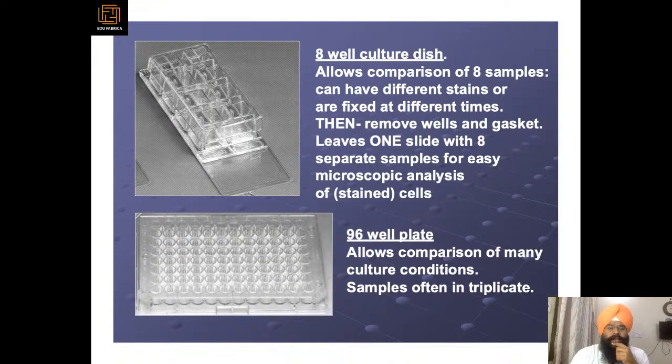So the cell culture environment could be an 8-well or a 96-well plate culture. It depends upon how you are looking for your results. So your cell culture will be transformed into that type.